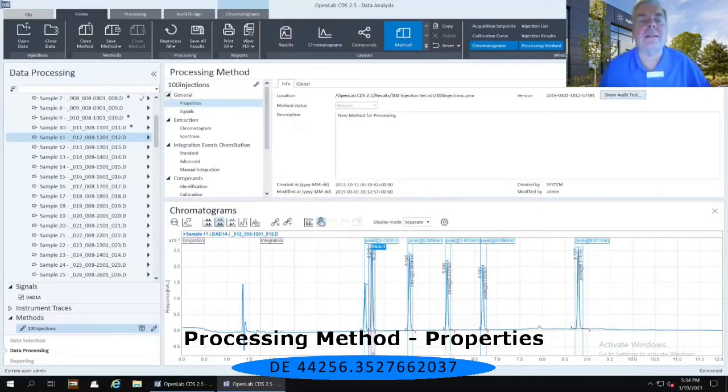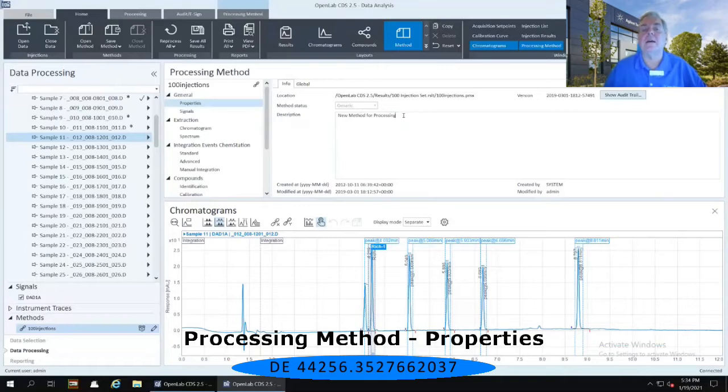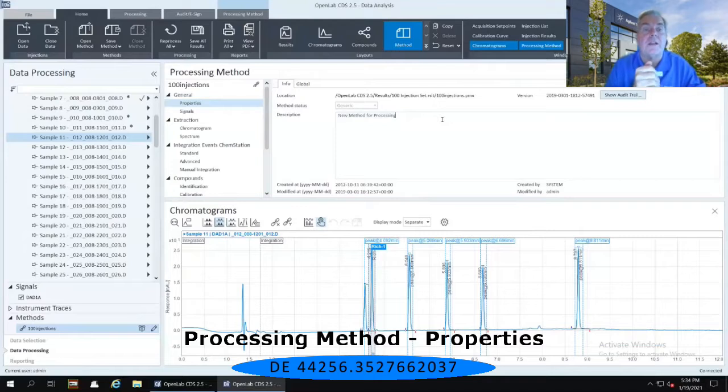Well, the first tab of the properties is an information tab. So we can type in some additional information about this 100 injection method.